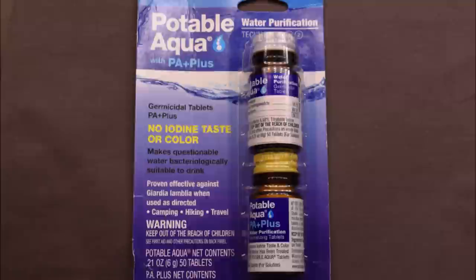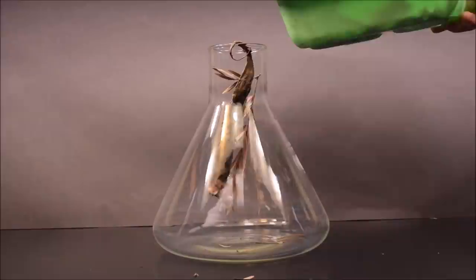In this video, I will be testing potable aqua water purification tablets. The first thing I'm going to do is make some dirty water and grow some microbes.